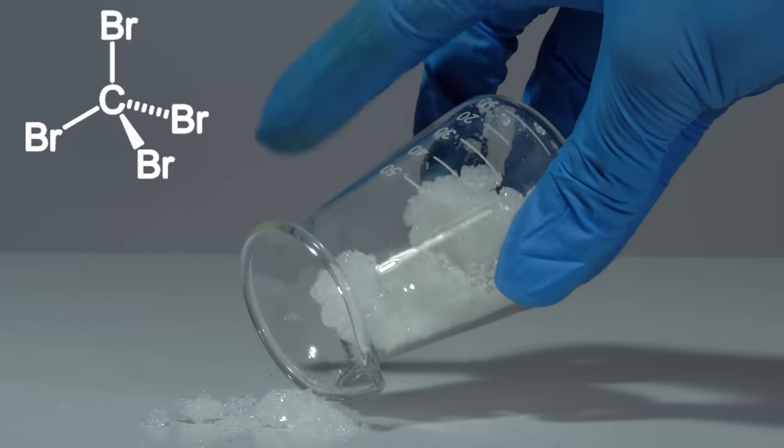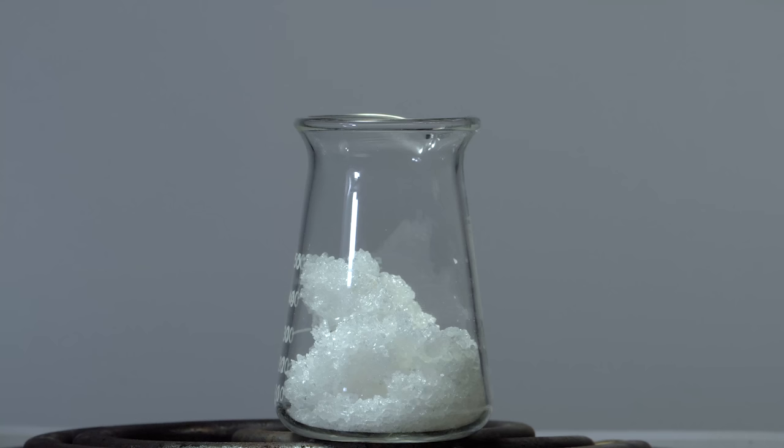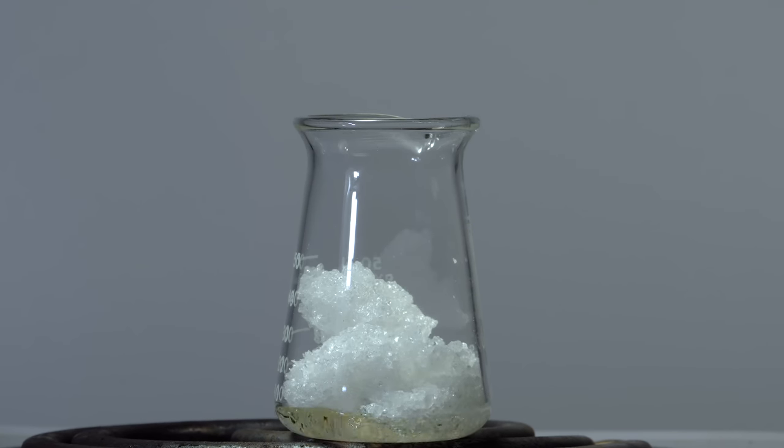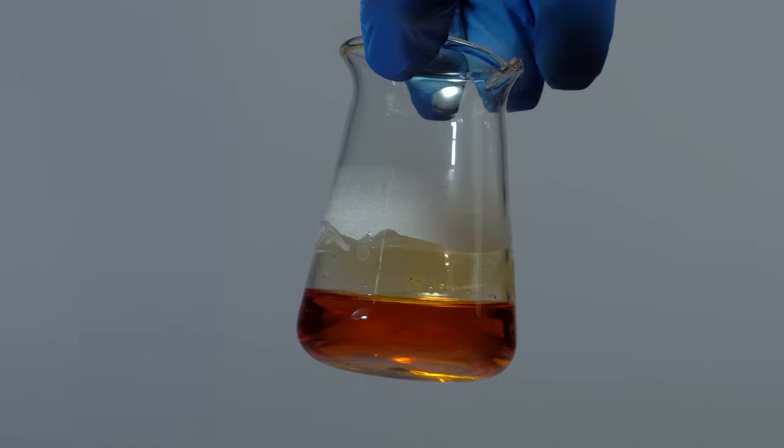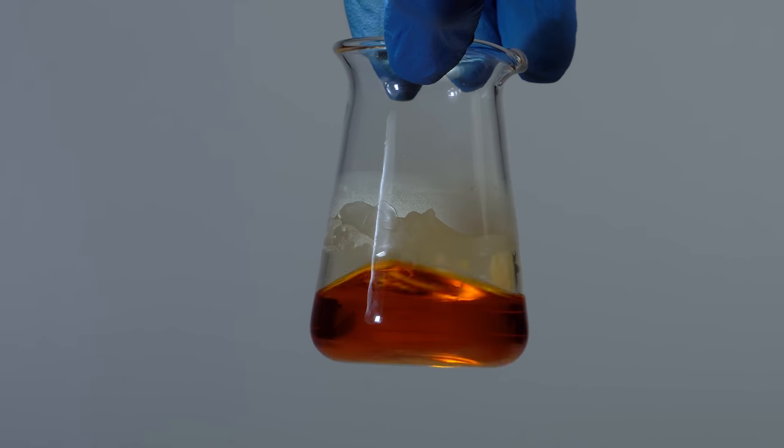These white crystals of tetrabromomethane melt at about 100 degrees Celsius, turning into a brown-orange liquid. Well, let's drop burning magnesium in it.